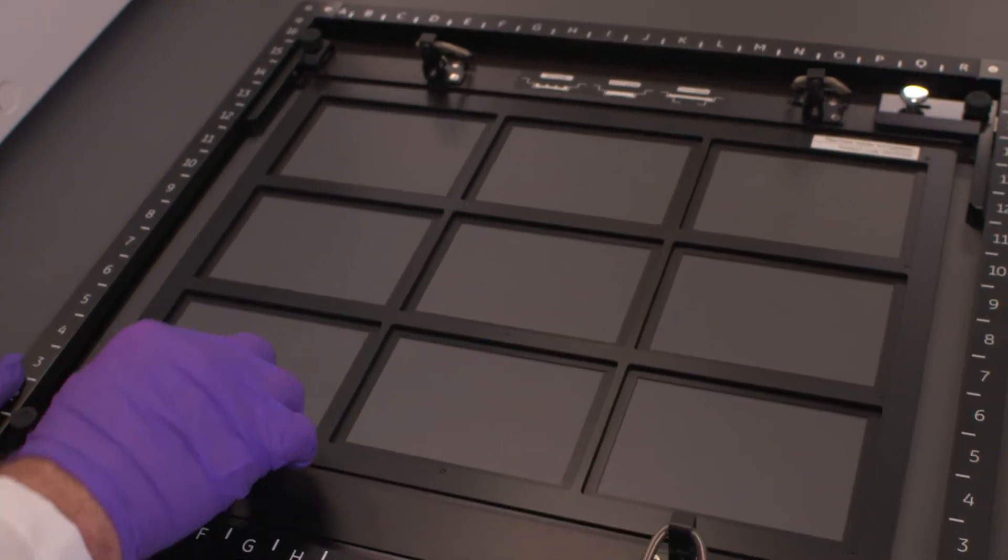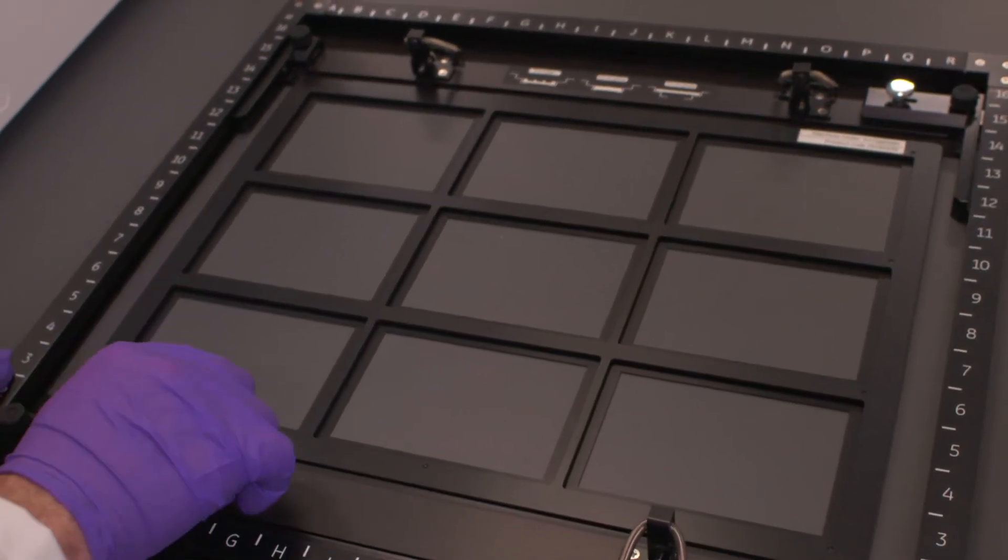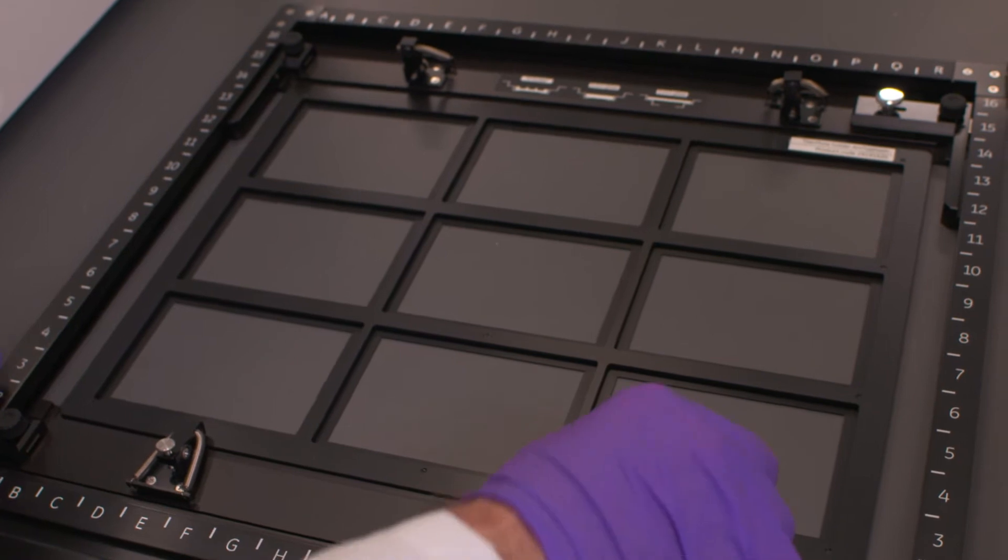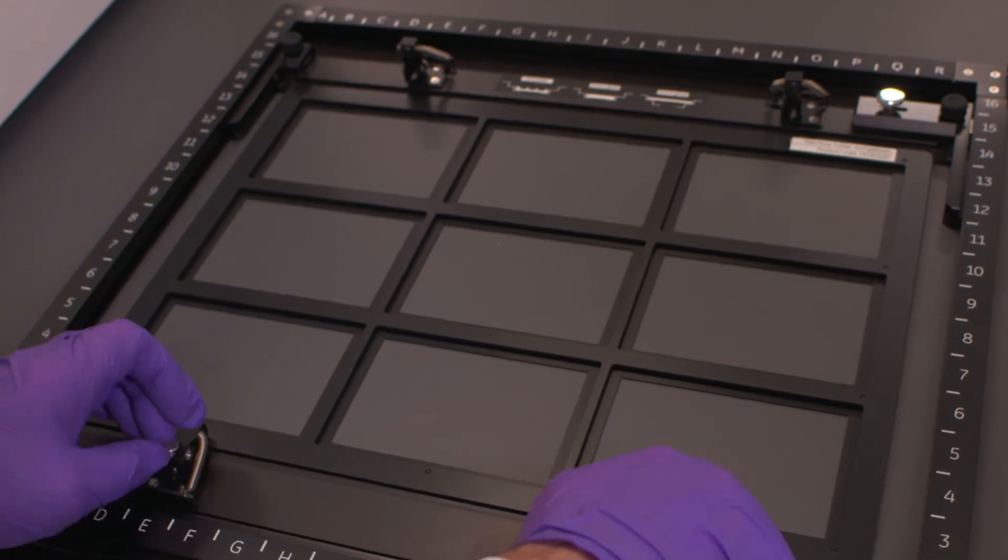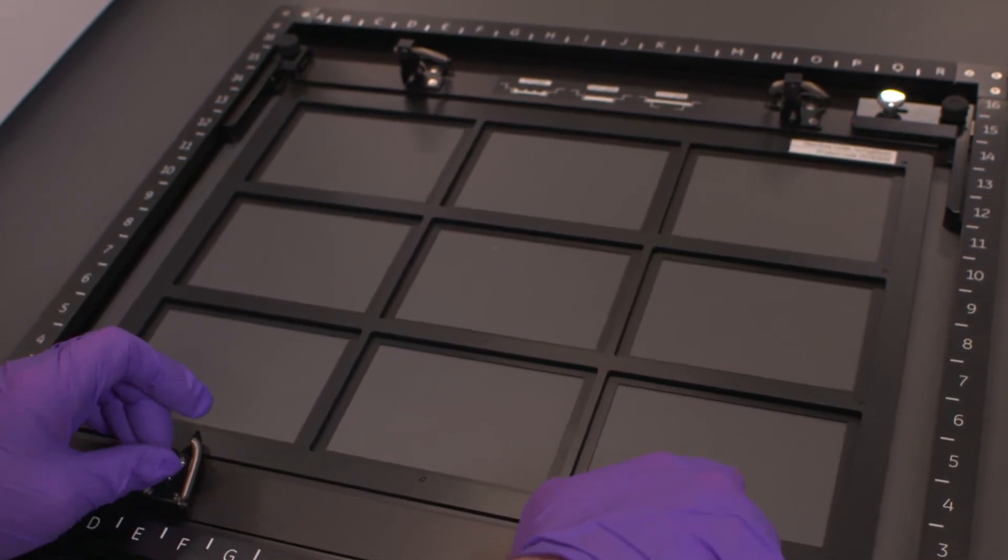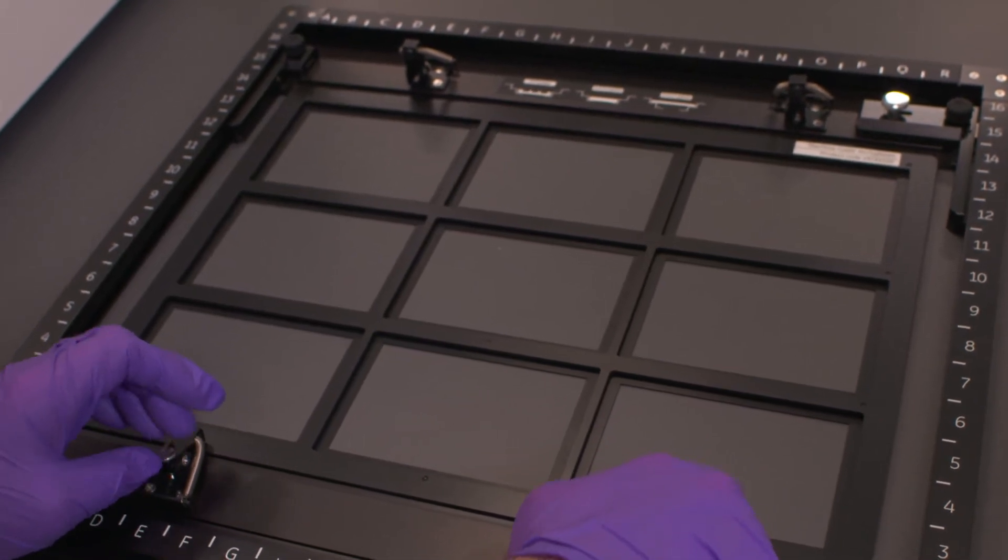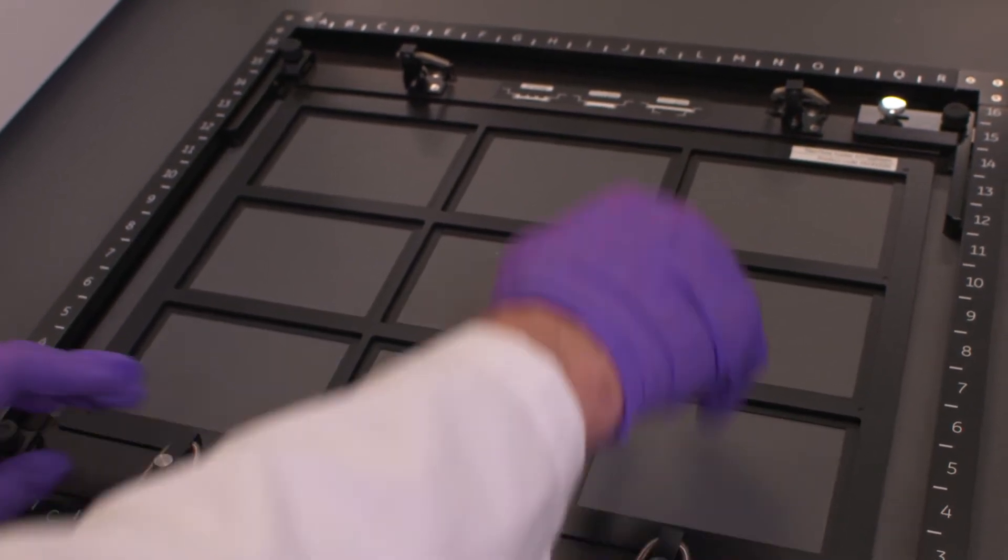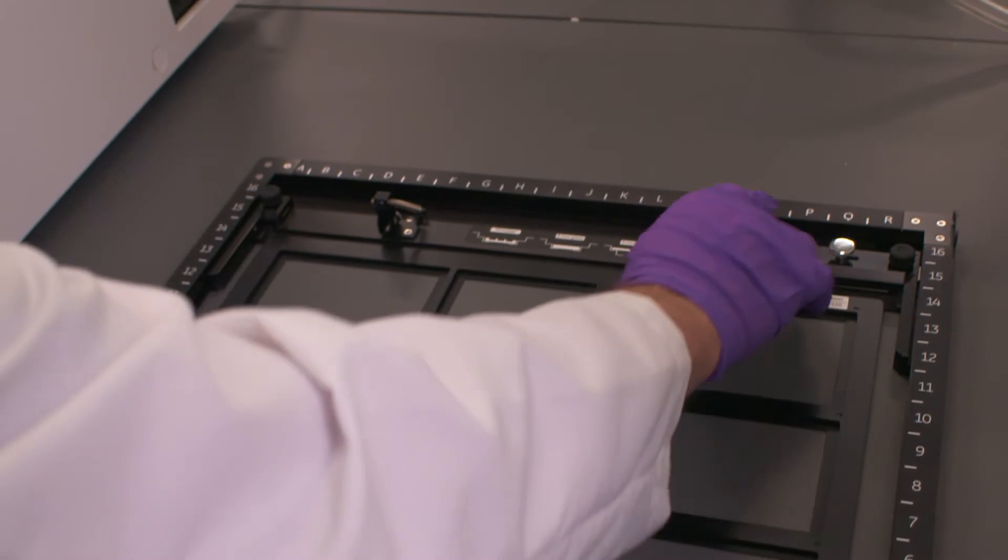Once we have that in the correct orientation, we're going to close the clamps and then we'll screw these until we have this tightly locked into place.